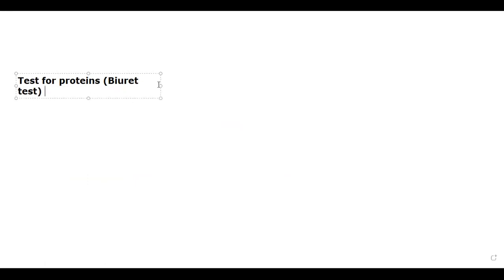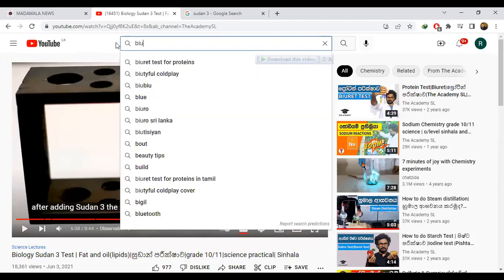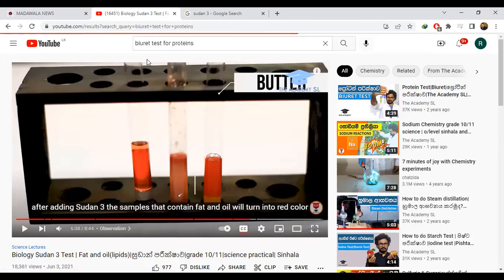What is the name? Biuret test. So first of all, we will go to see the biuret test for proteins. Thereafter, we will come back to the procedure.